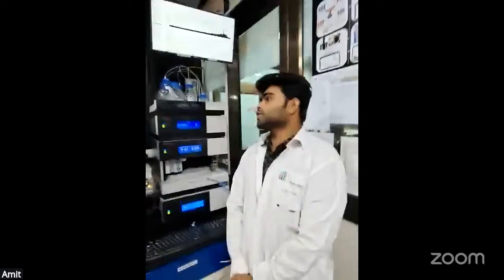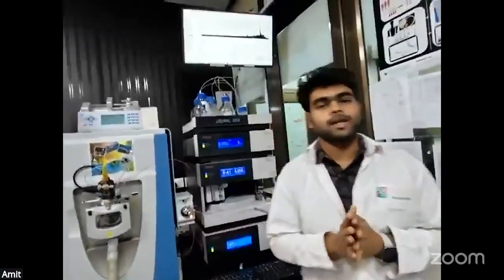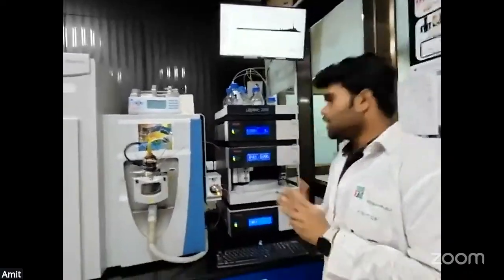As we have shown the Orbitrap Fusion, which uses three different mass analyzers, now I'm going to give you a short demonstration of the Q Exactive, which uses two different types of mass analyzer. In Orbitrap Fusion, it uses the quadrupole, the orbitrap and the ion trap. In case of QE, it uses the quadrupole and the orbitrap mass analyzer.